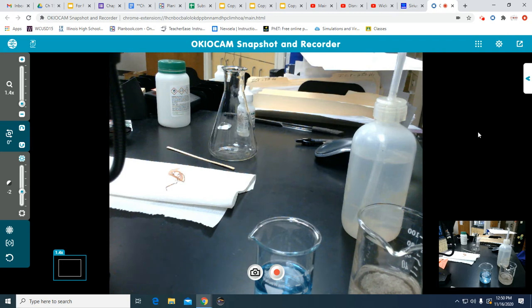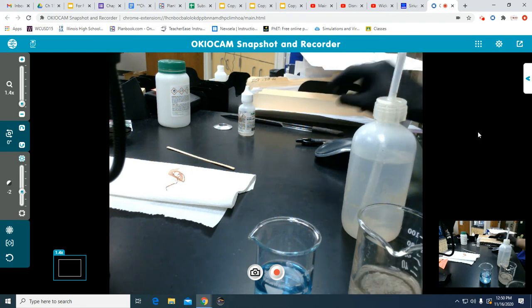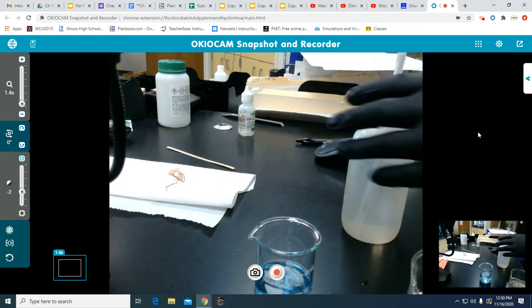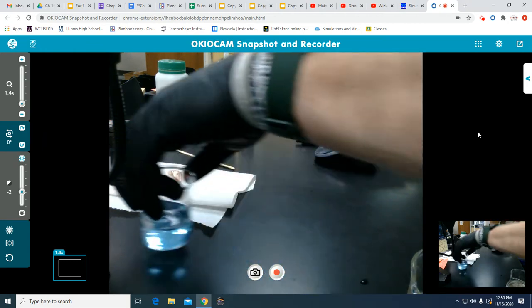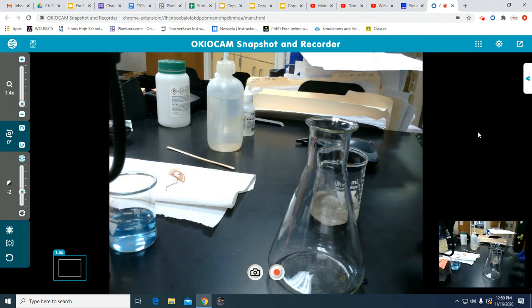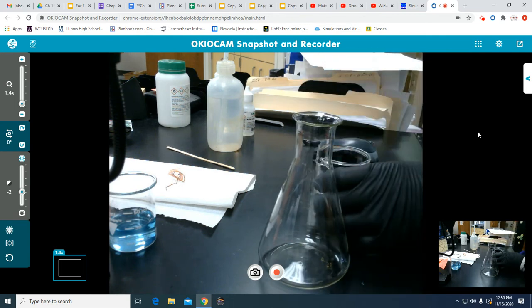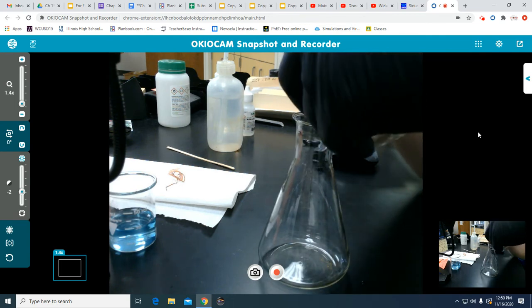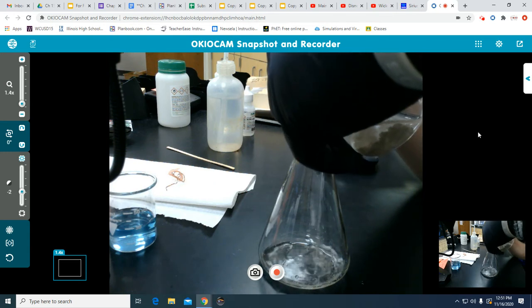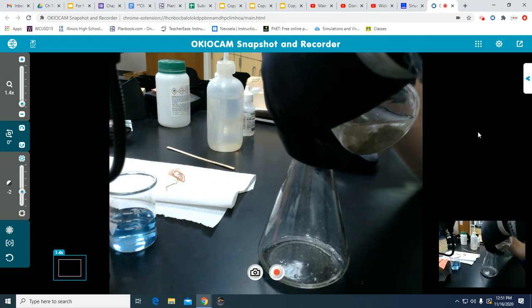What we need to do is try to decant the liquid here. I'm going to go back to my stirring rod because it's got this nice little rubber part here, and I'm going to try and dump this out. This is my waste container here. So I'm going to try to dump this water out without losing any of the product as much as possible.